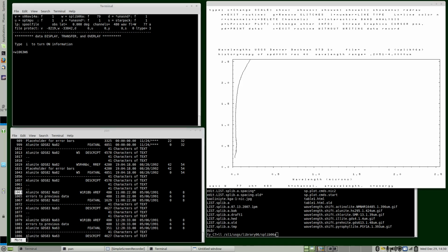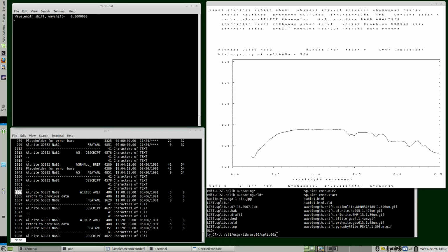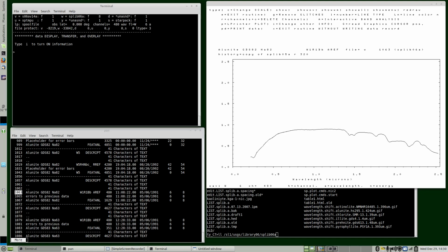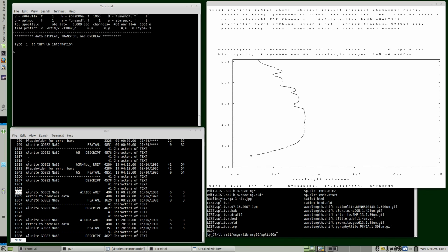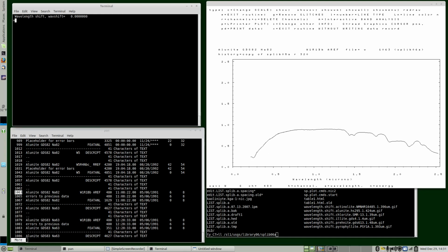Okay, so W1063, W6. Now if we do W6, capital W1063, and it reflects it on. So you have your choice. You can manage this, or you can use these wavelength pointers. If you don't want to look up the wavelength pointer all the time, in the spectral libraries, they should all be set correctly. So if we go out, W1063 ampersand will put the pointer of the wavelength set in place.